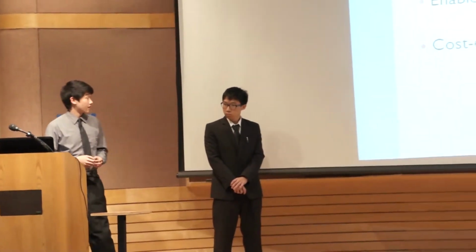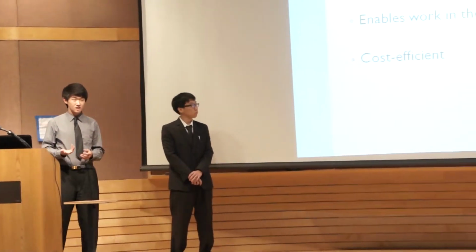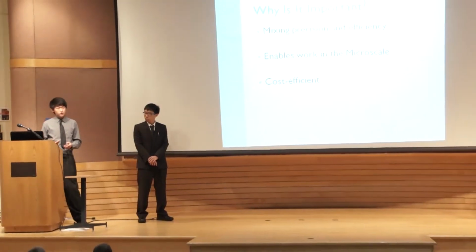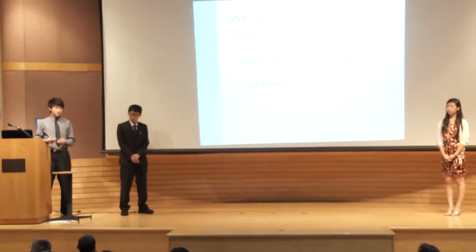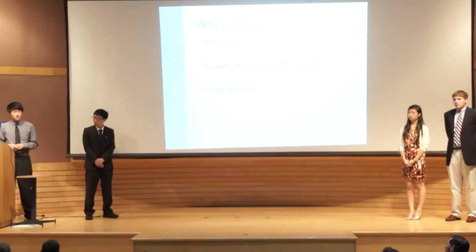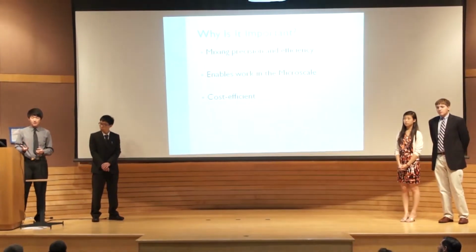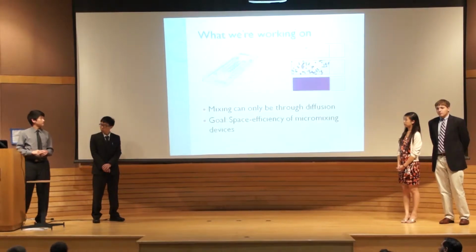Also, when working within the microscale, a little goes a long way. Just a single drop of blood can fill an entire microfluidic device. This allows you a lot more options when working with experiments in areas such as genetics. Finally, and perhaps most importantly, it's cheap. After you've created your design and created your mold, it takes us a few dollars to create a whole bunch of microfluidic devices. This allows you to have an enormous amount of experiments that you couldn't really do in a normal lab, just due to cost and efficiency.